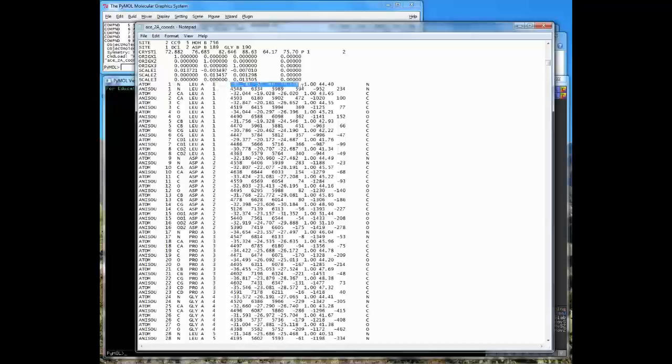And for this atom, what we have is 3 coordinates here, x, y and z. So we could plot this atom in space using these coordinates. This is the occupancy, which don't worry about now, and the B factor, which we also don't worry about now. But basically what I want you to see is that the output of our experiment is a list of atom positions, x, y and z, for all the atoms in our crystal.